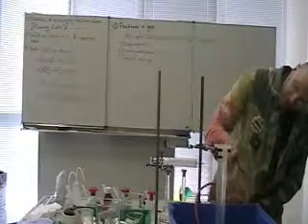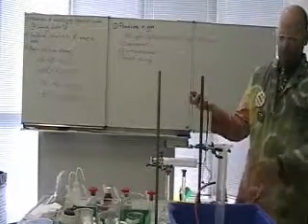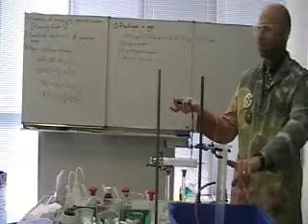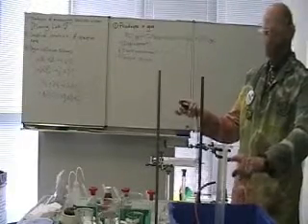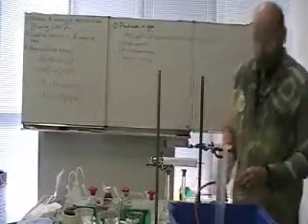And since the measuring cylinder reads from the bottom, I can have a stopwatch in my hand, and I can say what the volume is at 10 seconds, 20 seconds, 30 seconds, 40 seconds, or 30 seconds, 1 minute, whatever. You can choose a time interval, and you can write down the volume of gas that's produced. So that's a pretty easy way to do it.